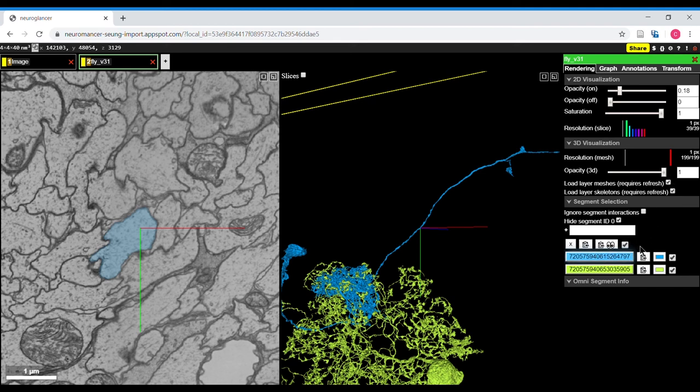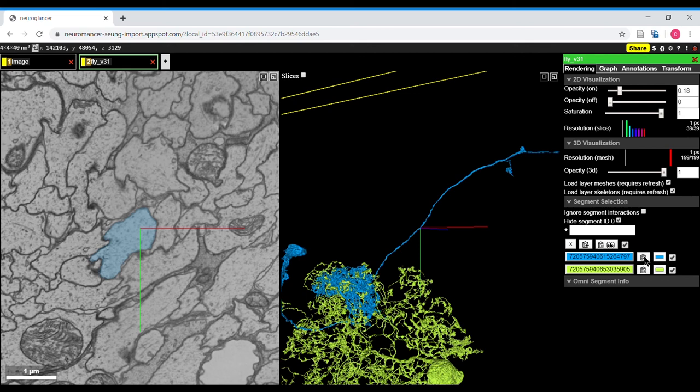Down here, I mentioned deleting segments by clicking on them. You can also copy this segment ID, and you can also paste segment IDs in this window and hit enter to bring them up.